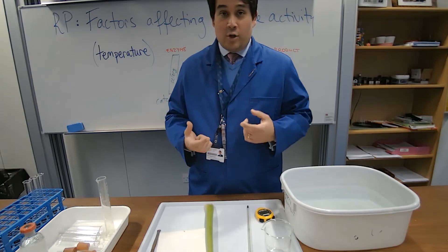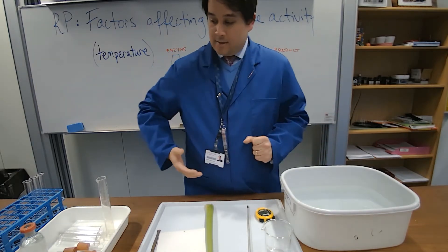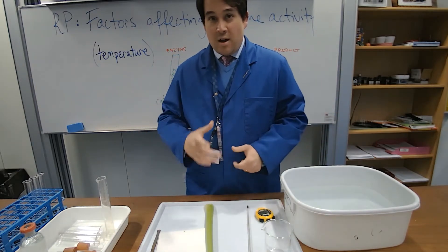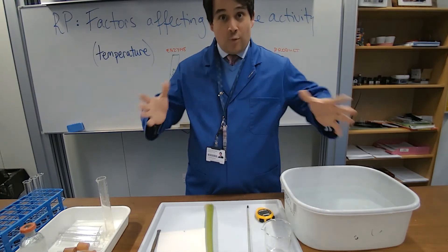So what we're going to do is we're going to try and measure that oxygen gas being produced. How are we going to do that? We're going to use water displacement, so a bit of fancy glassware. I'm going to set it up, and then I'm going to talk you through the whole process.